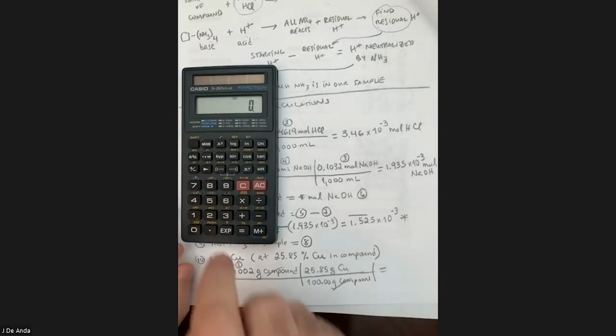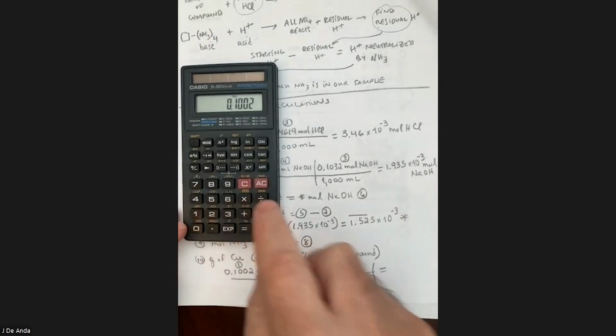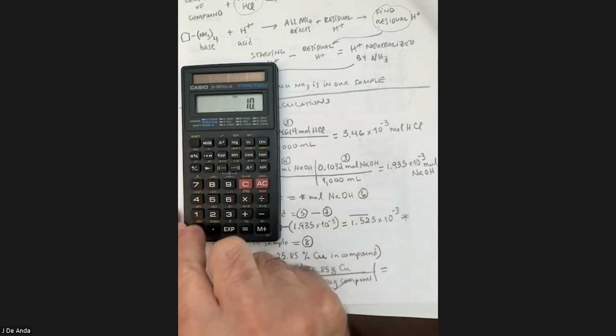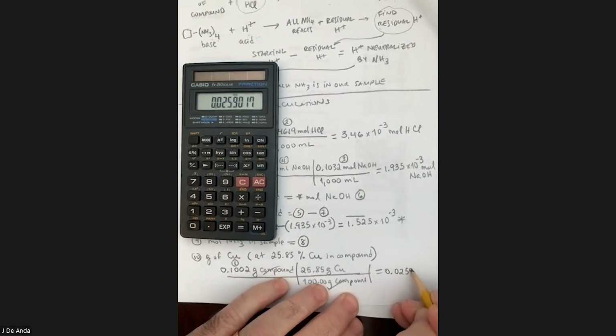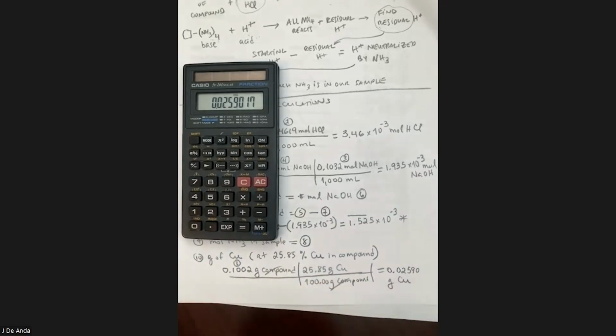So that is going to tell us how many grams of copper were in this sample. So let's go ahead and do that. We have 0.1002 grams times 25.85 divided by 100. And that gives me 0.02590 grams of copper.